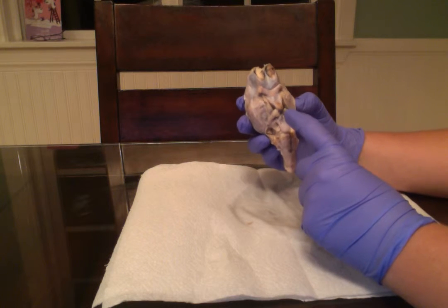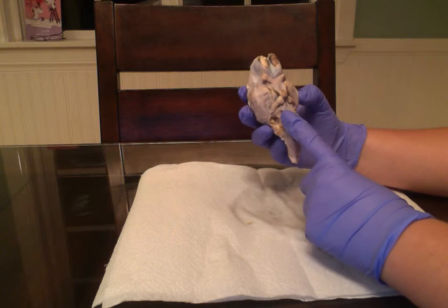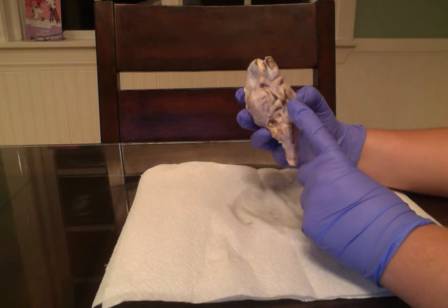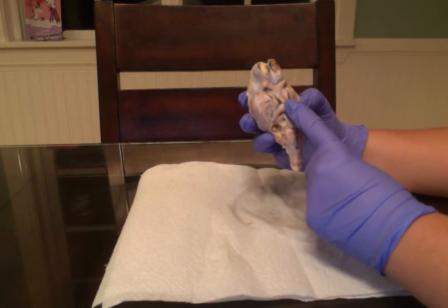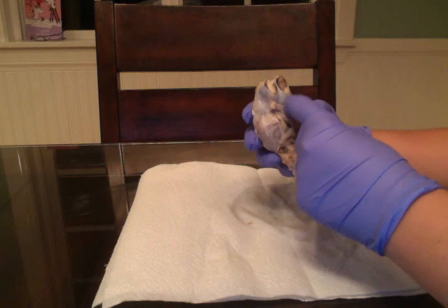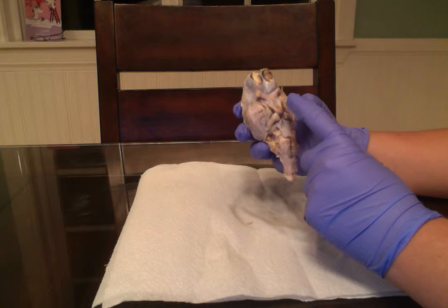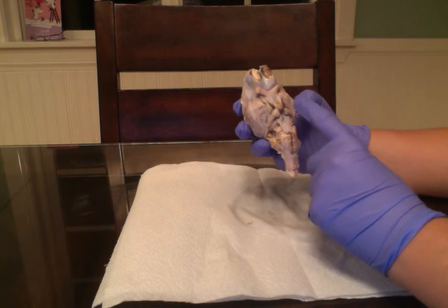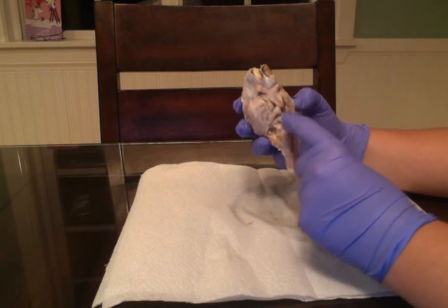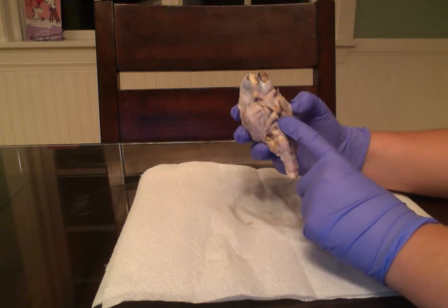And we have the cerebral peduncle, which would be here. We have the hypophysis, or the pituitary gland, which would be here. We have the oculomotor. There's one on this side and one on this side. We have the trochlear. The trochlear is here. And then we have the trigeminal here. And the abducens, which is here.